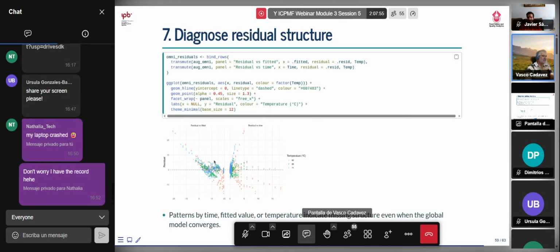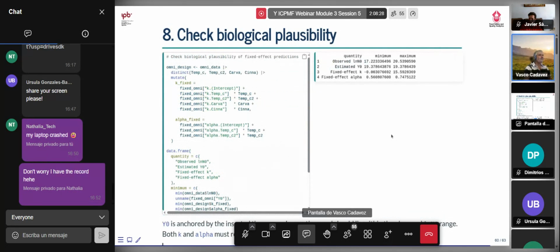But this is just to explain, so I don't need to find a better model, but you can do it in the future. So this is an example of something that you don't want to have in your final model, okay? In this case, for the temperature, you see, for the temperature 60, 65, 71, they are quite different, no, from one temperature to the other. So that means that we need to look for a better model.